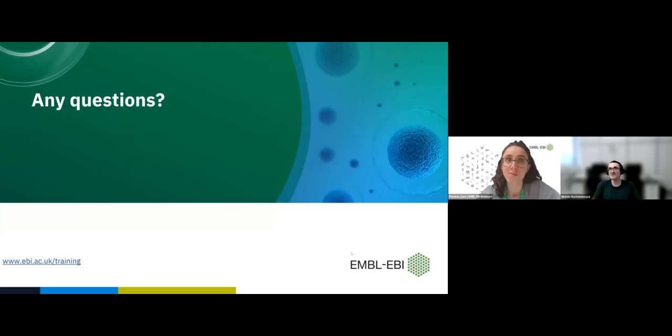So unless you are going to host the Vitessce app yourself, it's all open source, it's all on GitHub with instructions. Unless you are self-hosting the app, I would not use it with data that you are not willing to publish yet.